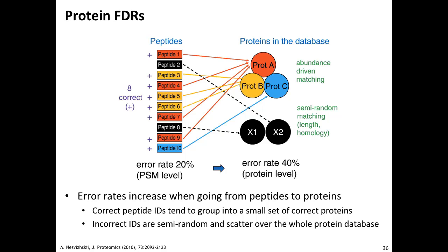And that is why I said earlier that the FDR at the PSM level is not really what you might be interested in. Because if you accumulate enough data sets, throw them all together, then you get FDRs on the protein level that are not what you would like to see. And then you hand your collaborators a long protein list that you collated based on these PSMs, and 50% of them are just nonsense. And that's just not a good idea.